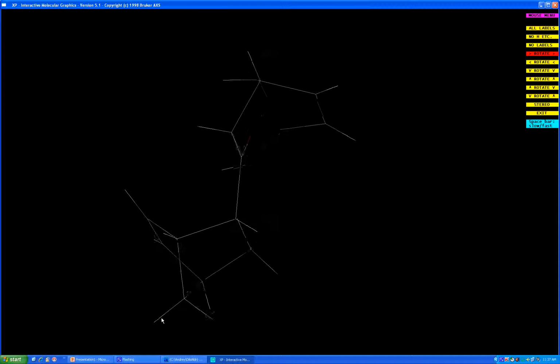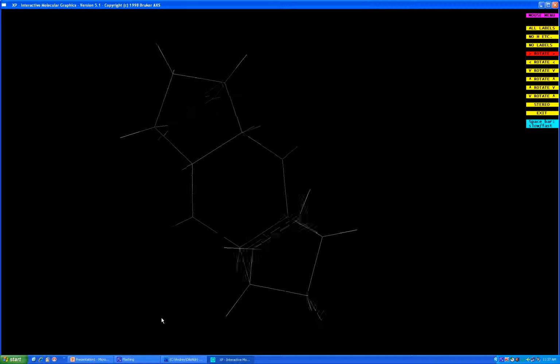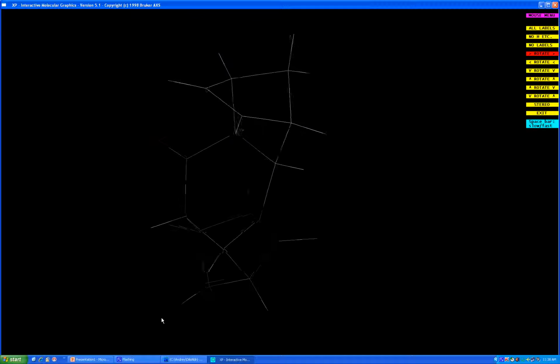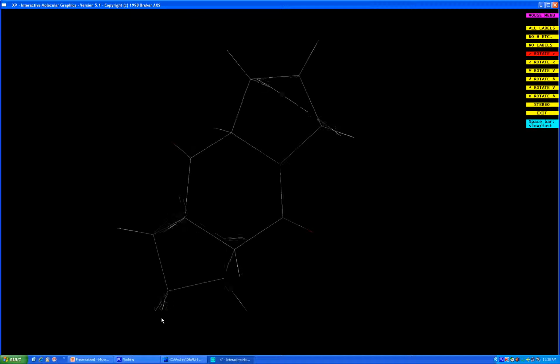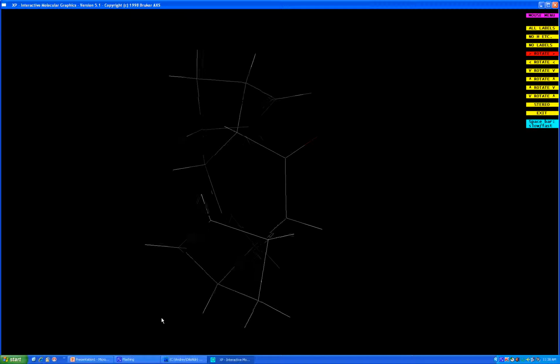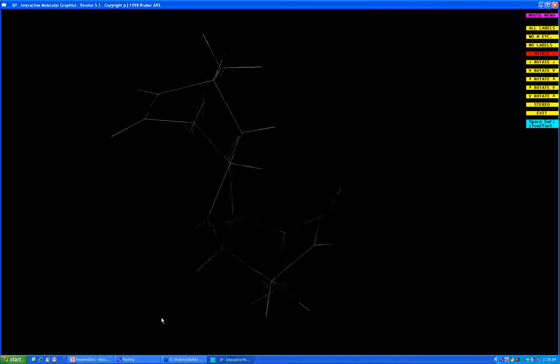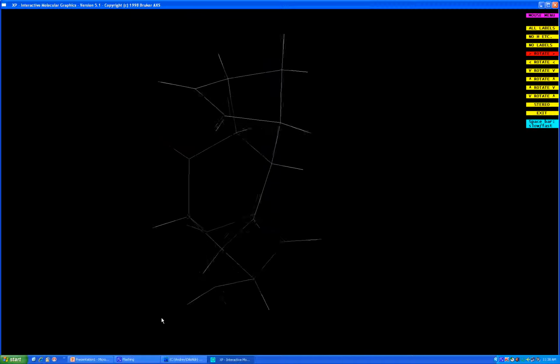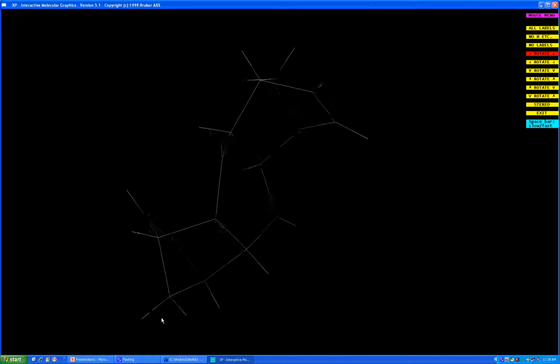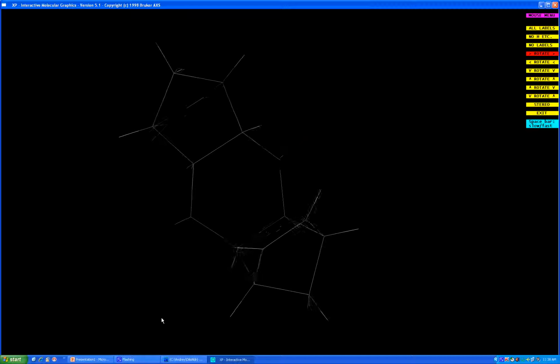Let's try to do it again. Okay, so this way we find all our hydrogens. So we actually find them from residual peaks of electron density. Another way is to put hydrogens on calculated positions, but we will do it maybe when we discuss organometallic structure. Here I can easily find my hydrogens, so I can actually refine their position and their thermal parameters very easily.